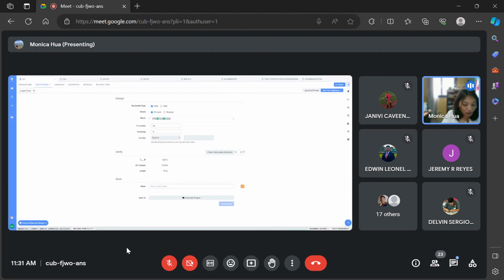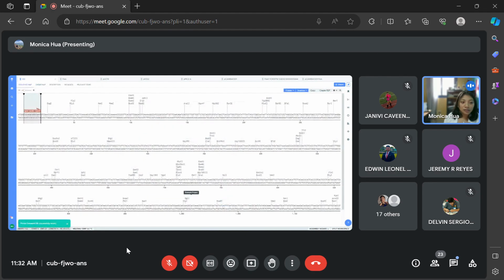That's how it goes, guys. All right. So you make your primers. My GC content is still high, but I have an okay annealing temperature. I have around 15 base pair right now. I left it as it is. I will name this forward primer. Oops, already exists. Which one is this? OD. So I'm going to name it forward OD, save it, and it should appear there.